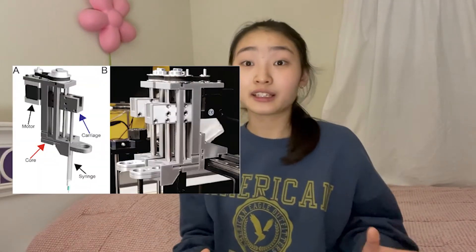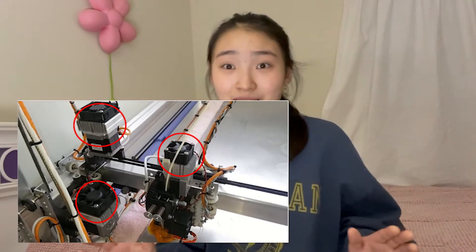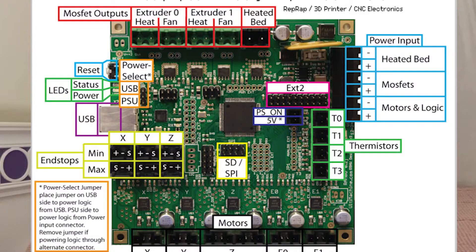The extruder is like a piping bag that deposits material, and it controls when and how that material is deposited. The control system is a series of motors and belts that move the extruder around along a print path to enable the shape that we want. The controller board is the brain of the 3D printer — it takes in information from the G-code file and translates it into precise movements for each part of the printer to make the desired structure.